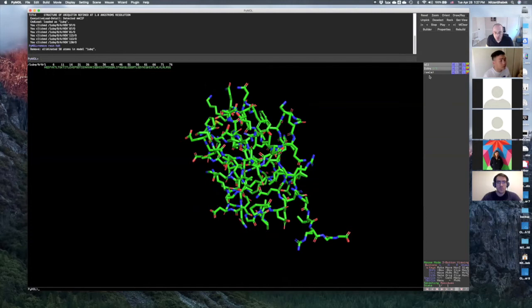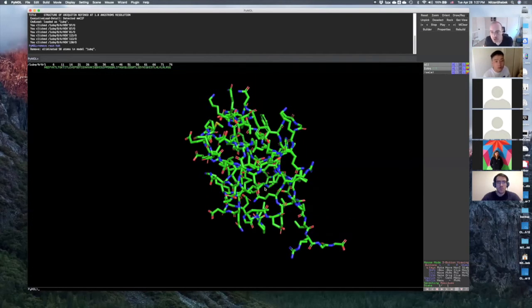So this part will always be, once we press something, a select. If you press the select, you will probably find the first amino acid that we selected before, but this is going to change every time. Two things you need to remember with PyMOL: the undo is not working. So for everything that you do, every progress you make, you had better save it as a session. We're going to get to it.